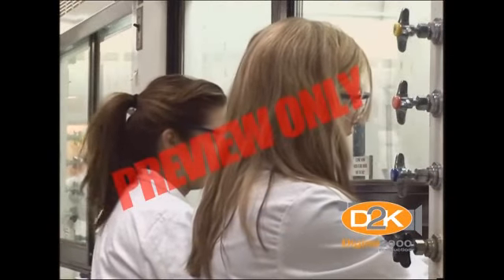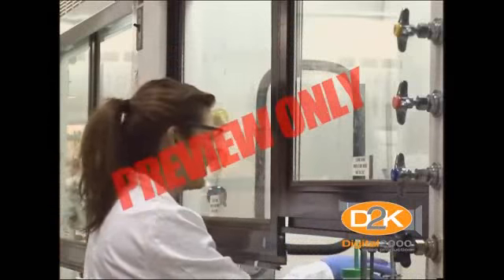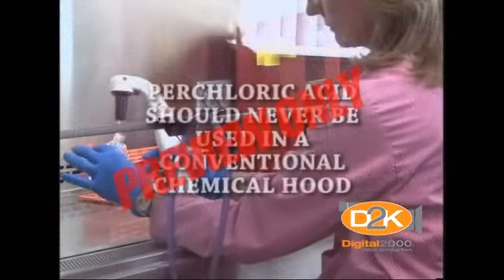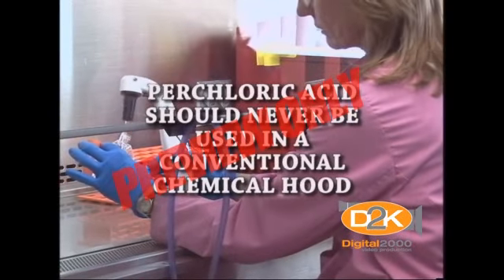Before beginning work, you should verify that the type of chemical hood to be used and the face velocity are appropriate for the chemicals involved and for the procedure you are performing. Perchloric acid should never be used in a conventional chemical hood.